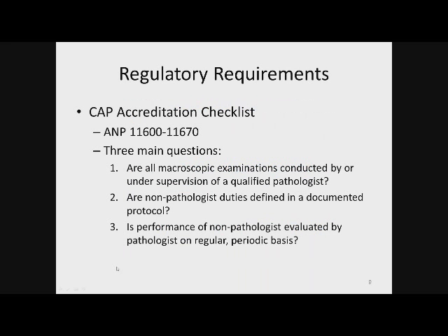So in the CAP accreditation checklist, there are three main questions that come into play when having somebody other than a pathologist gross. The first one is, are the macroscopic examinations conducted under the supervision of a qualified pathologist? Are non-pathologist duties defined in a documented protocol? And finally, is the performance of a non-pathologist evaluated by the pathologist on a regular, periodic basis? The regulatory requirements have been cleared up recently.